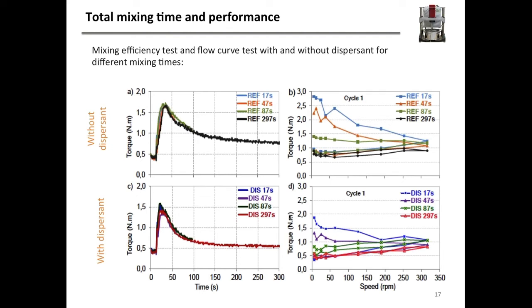Now, here we've been looking just at the number of seconds, the time you're mixing your mixture before you get to stability.